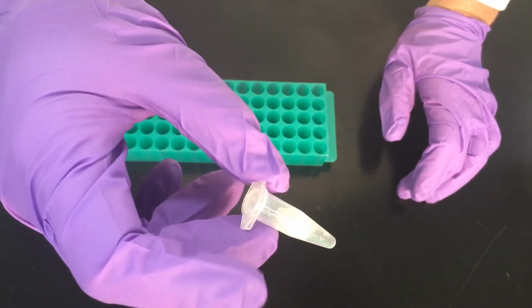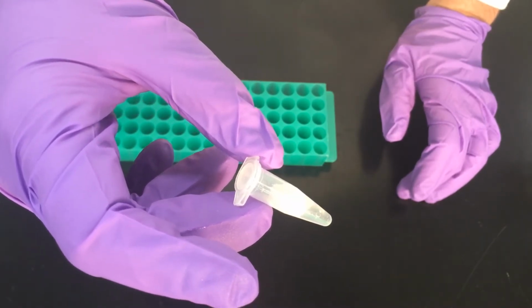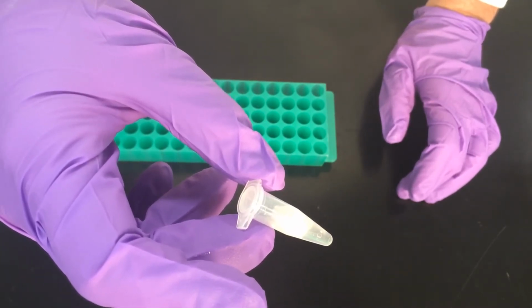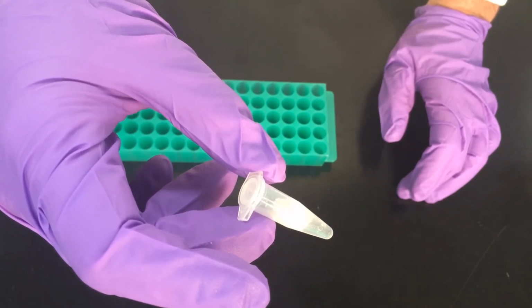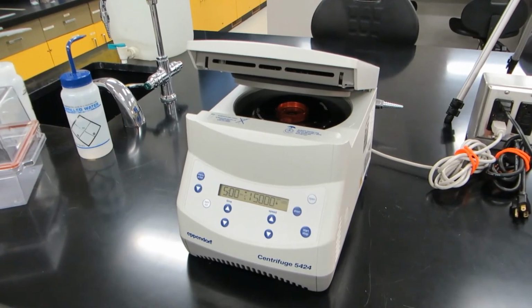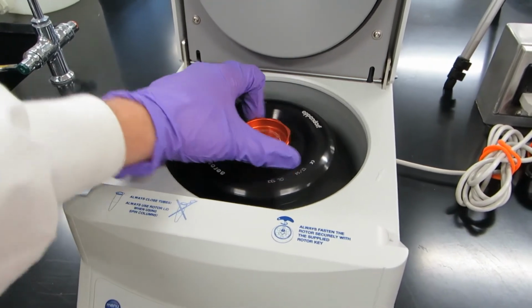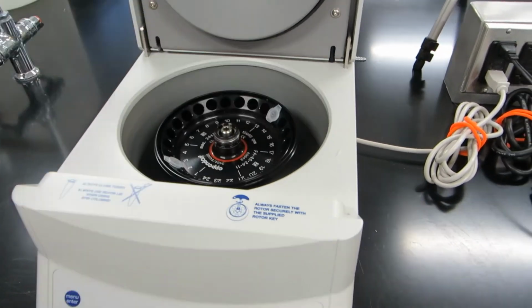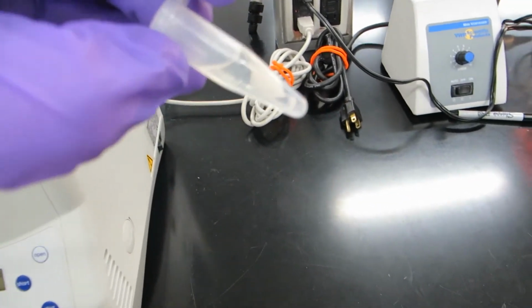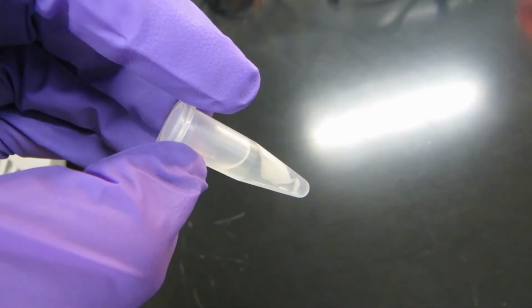So the next step is to put this in the microfuge for 5 minutes and get the big white pellet in the bottom. So like I said before, the white pellet is going to be your genomic DNA and all sorts of precipitated proteins, and this plasmid and other solutes will remain in solution. Our 5-minute spin is up. Let's take a look at the precipitate. So there it is. Hopefully you can see it. You can see the precipitate has come out of solution.